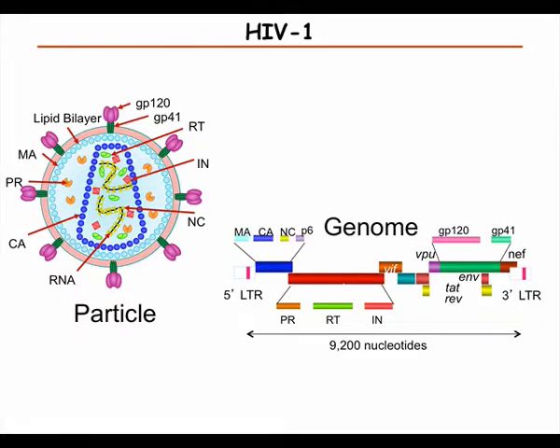As you know, the HIV genome is extremely compact, so everything seems to be very optimized in it. So in this case it's actually very difficult to put in a genomic tag anywhere without disturbing the virus and making it less viable.